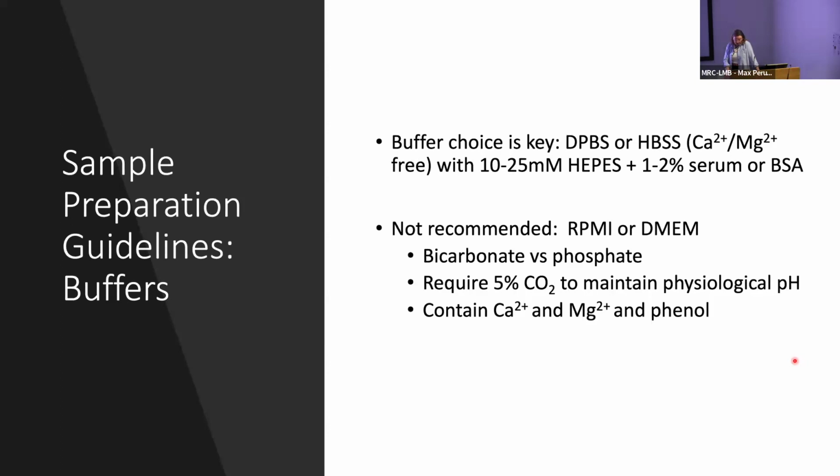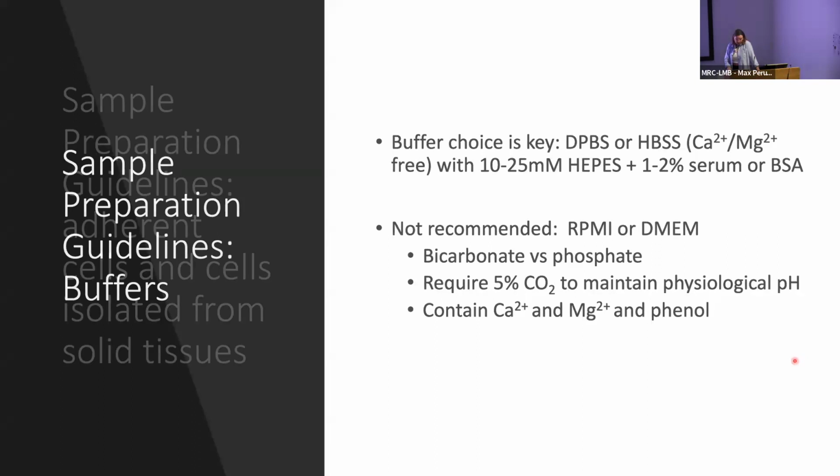You can add 1 to 2 millimolar EDTA and 25 millimolar HEPES. Keep in mind that HEPES-buffered bicarbonate media is light sensitive, so protect it from light.